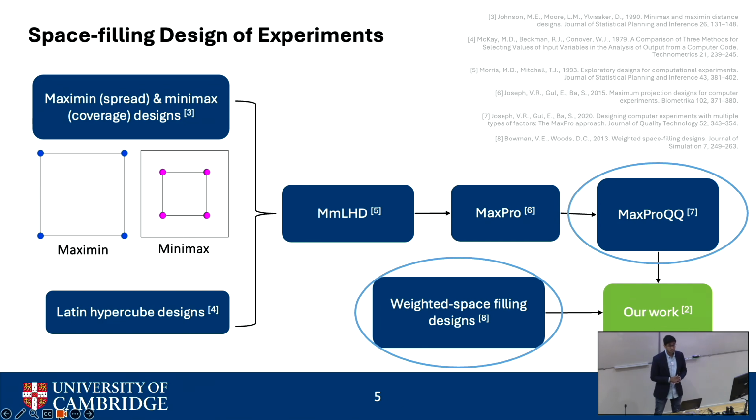This group at Georgia Tech published a really nice package called MaxProQQ, and the QQ here stands for quantitative and qualitative, and this was one of the key challenges in developing a new DOE method, that I'm looking at a mixed variable design problem.